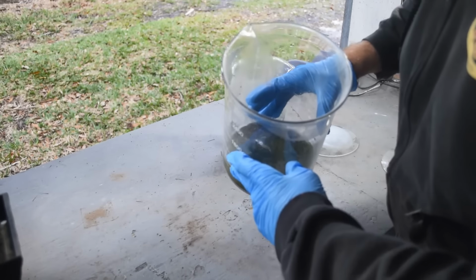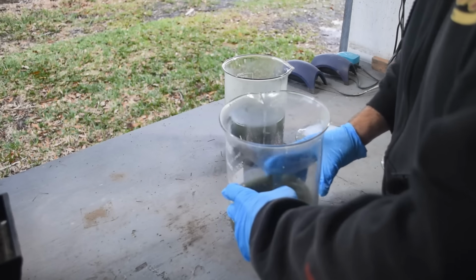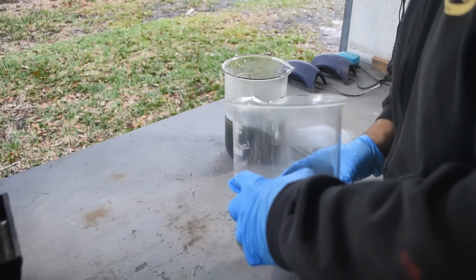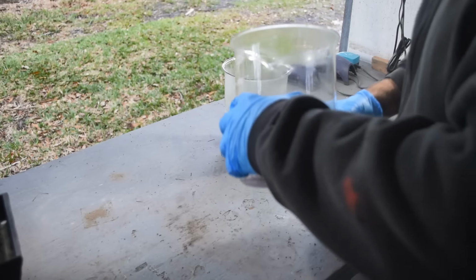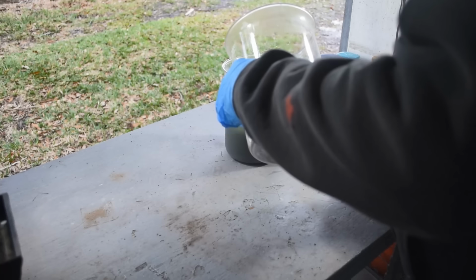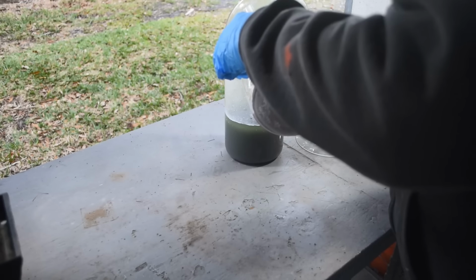What am I seeing in there? Crystals of some kind. Huh. That's interesting. Some kind of crystals formed. Let me decant this off and I'll give you a close-up look at them. I was not expecting that.